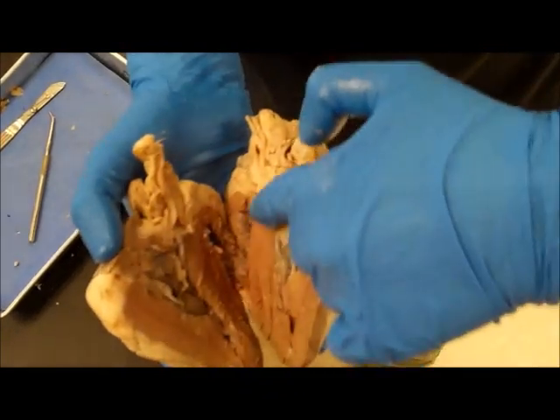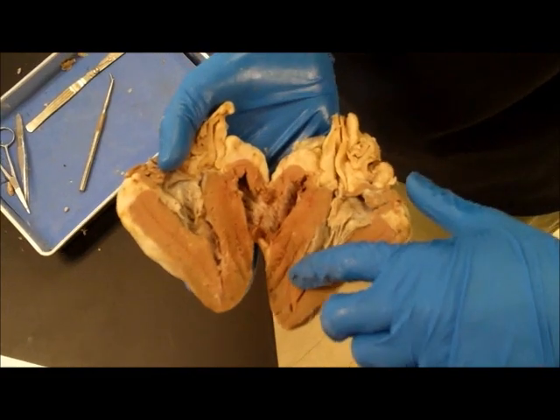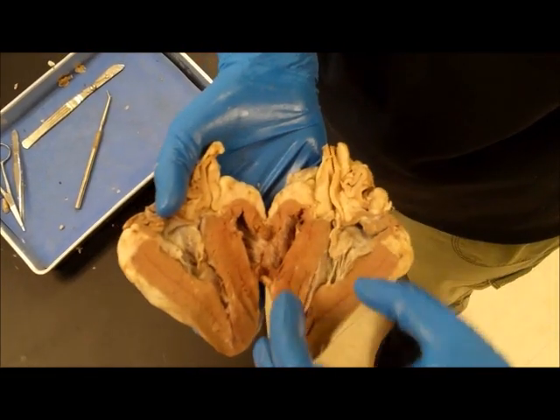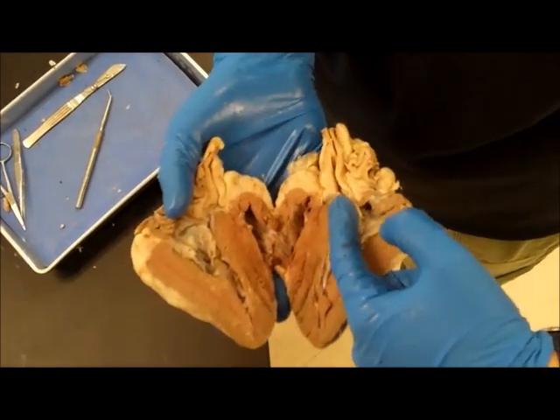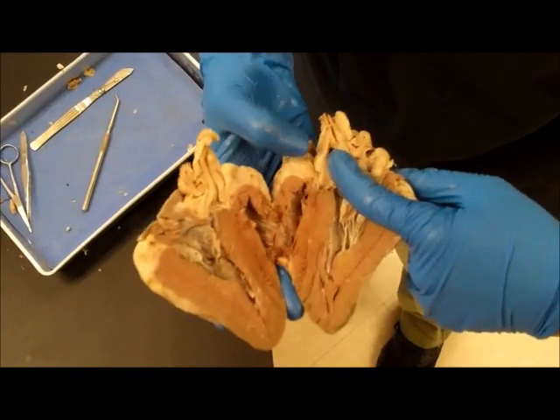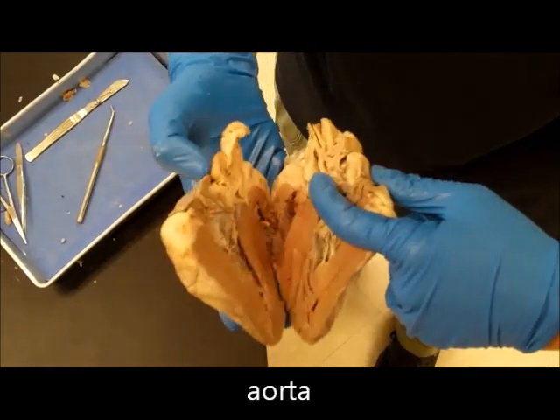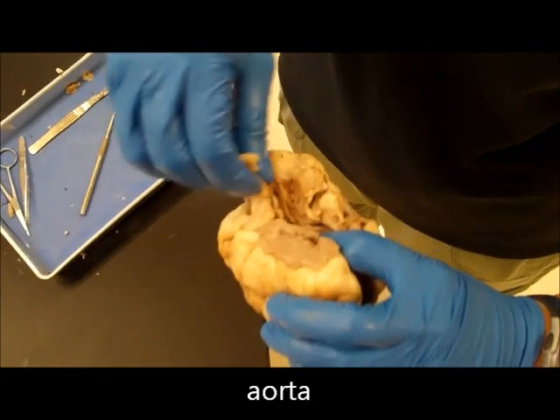So left ventricle here, the other side of the left ventricle. Okay, so we are in the left ventricle, and when it contracts, it forces blood up and out through this thick-walled artery called the aorta. So I have a part of the aorta here, and because we cut across this heart, the other part of the aorta is on the opposite side.